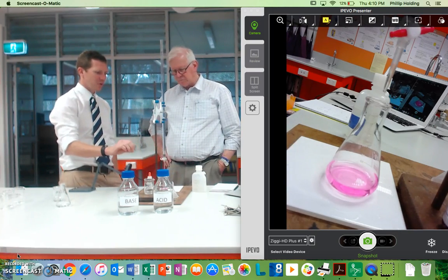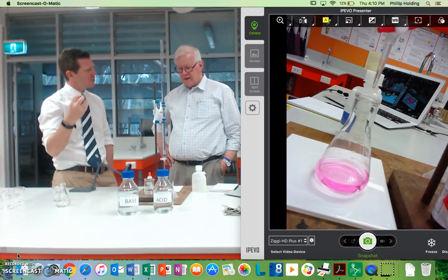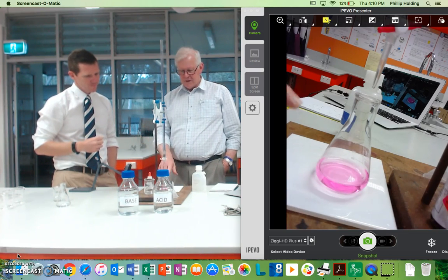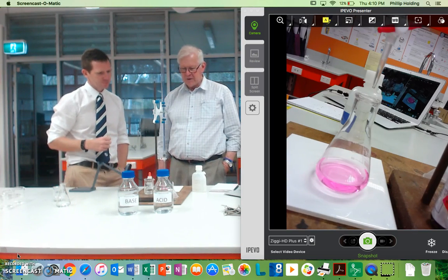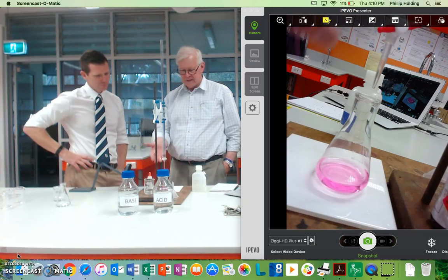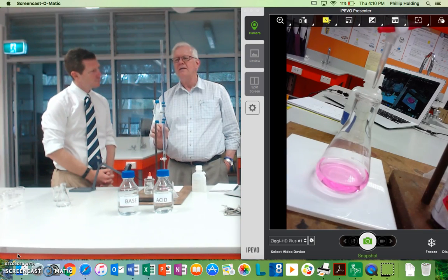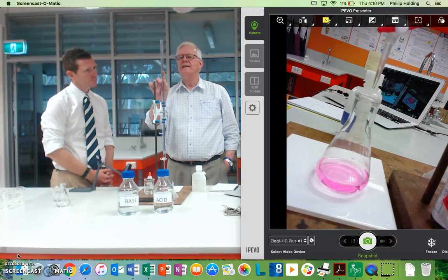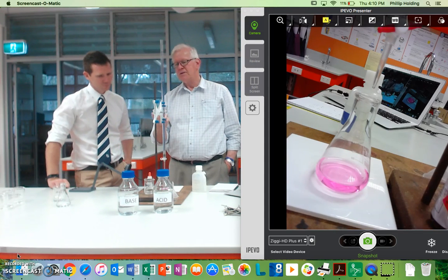So we are right on the edge — we have just stepped over the line. If it's pink, it's over. And you want it to be as pale as can be. That's not a bad titration, but you'd like it to be even paler than that — that's when you're getting very good, and that's when you wash that half a drop in, and that makes a difference. When you titrate, you'll do say three titrations, and you want them to agree within 0.1 of a mil — within just one line on the burette. You need two results to agree within 0.1 of a mil.